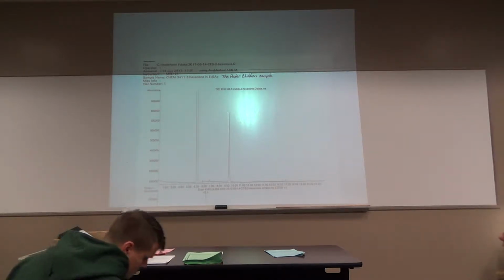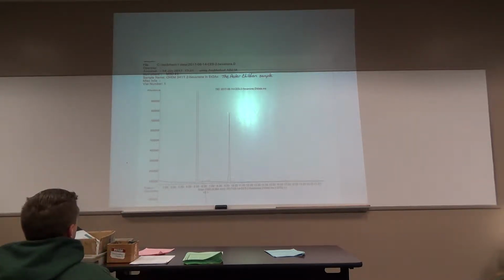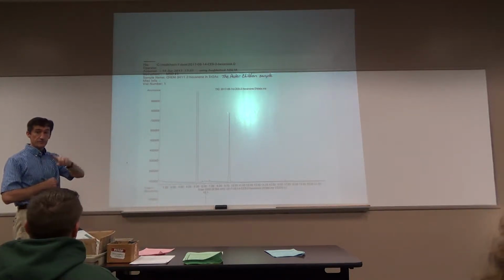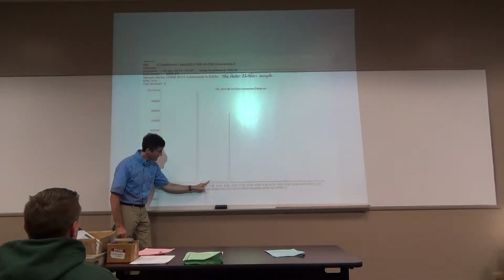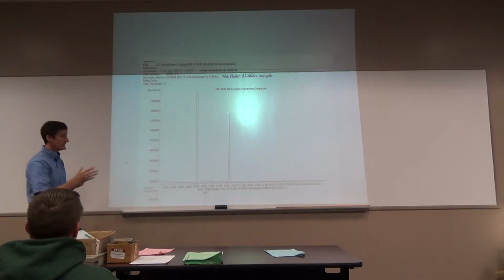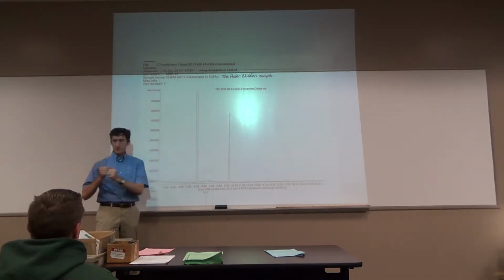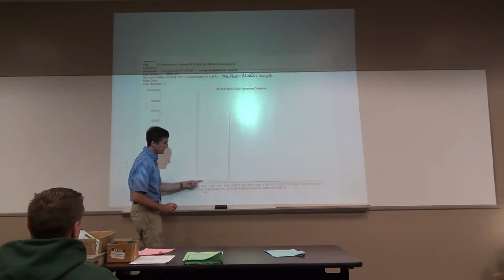You inject your sample and it goes to the GC and that separates any components. If it's pure, there's only one component and there will be nothing to separate, and it just gives you one peak. If there's multiple components, here's the GC of your sample. You have two major peaks. We also have a couple of slight baseline small peaks here. So, multiple peaks. Then, as each peak comes out of the GC, it's sent to the mass spec, and you get a mass spec of that compound, which is now purified.